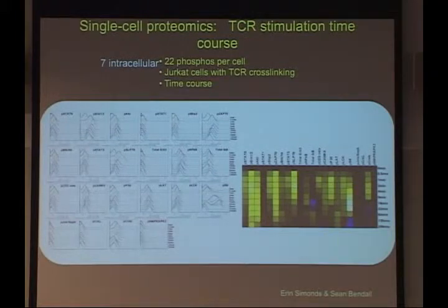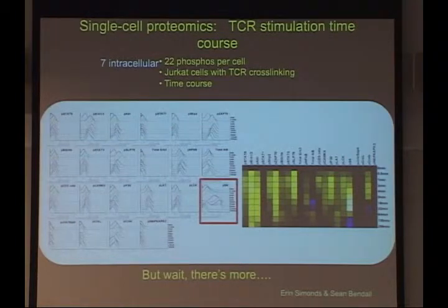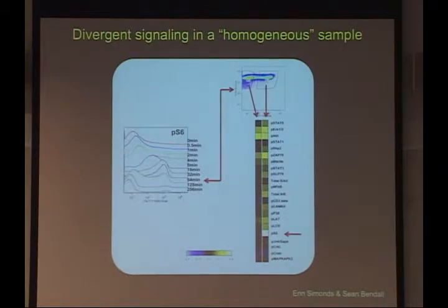And the point is that the data we get is very similar to fluorescence data. Even though this was done on Jurkats, a T-cell line, and there wasn't a lot of what we would call heterogeneity or different cell populations in the dish, it turns out that even when you're dealing with something that is seemingly homogeneous or consistent, when you drill down at a certain time point, you can subdivide based on even signaling responses, and you can actually capture different cell states happening in the same tube.